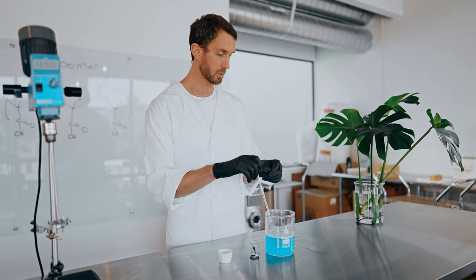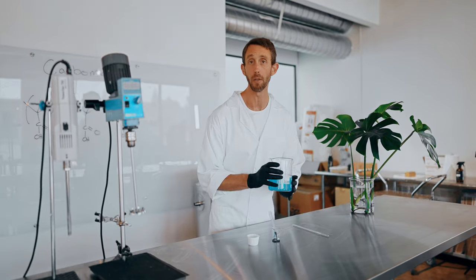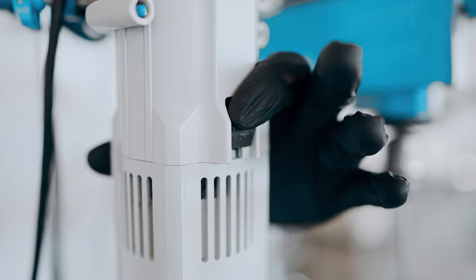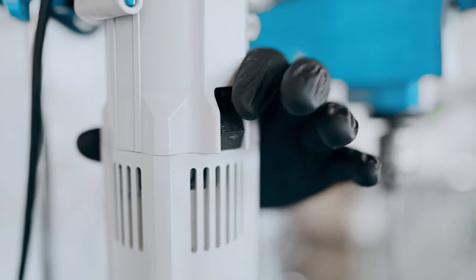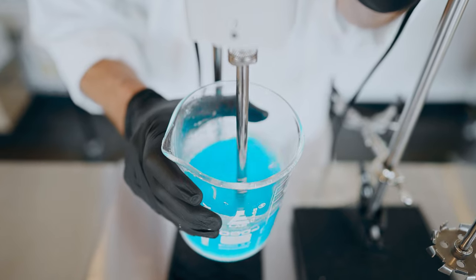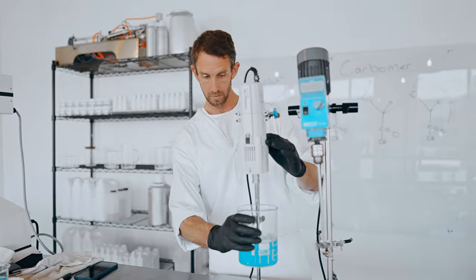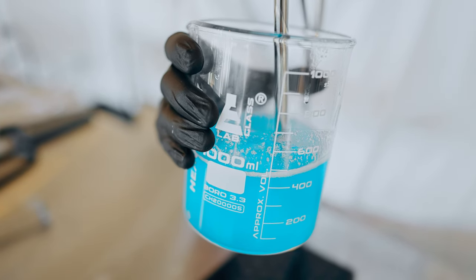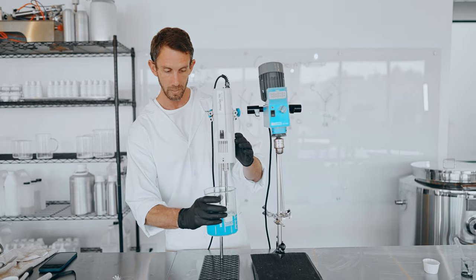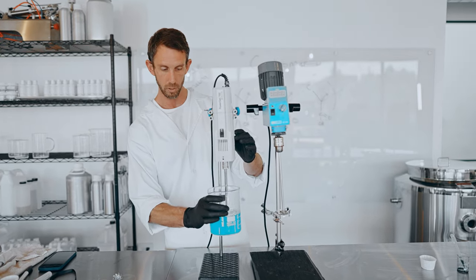We've got the first phase of the carbomer dispersion down. Now we're going to hit it with the homogenizer, which is going to really disperse it evenly. As you can see, it's really trying to blend everything up, but we don't want to do it too quickly because if we do, it's going to introduce too much air into the solution. And when you do that, you're going to be left with a very cloudy mixture.